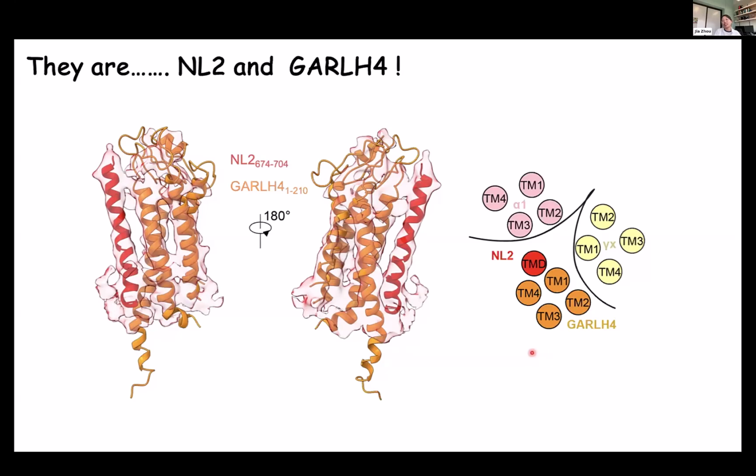This part really matches the published functional paper. But I want to say this part is still pretty limited because our resolution is very low, just around 4 angstrom. It still needs further validation.